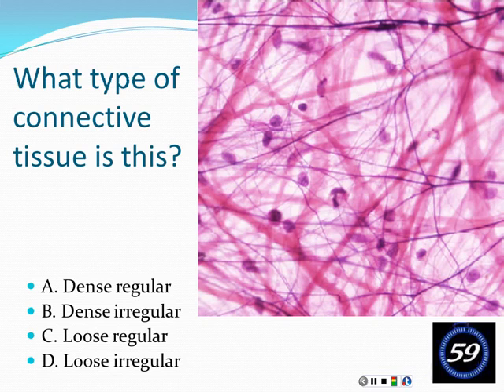There we go. Okay, so we didn't get to the questions last time, so we're going to do them now. All right, so what type of connective tissue is this? Oh, we have some disagreement in this one. This means it's a good question.